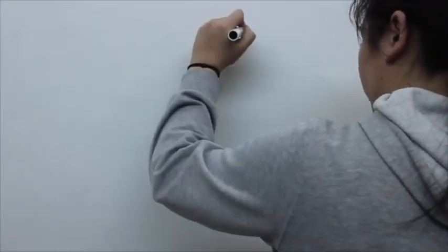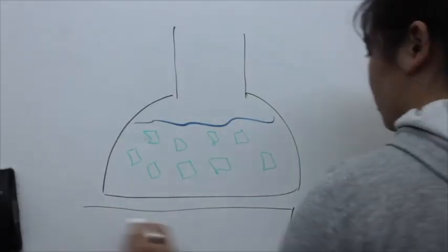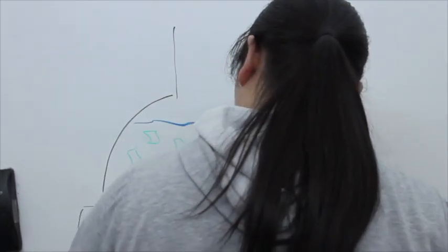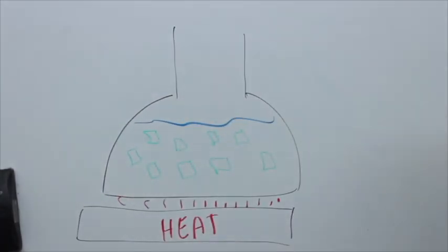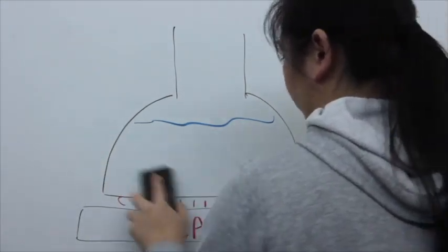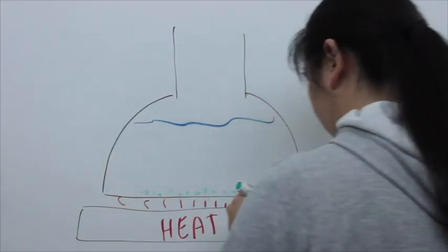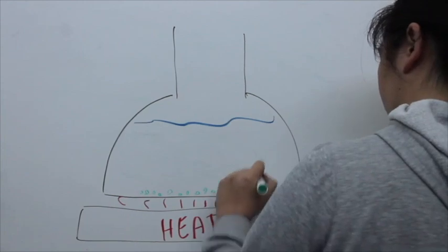Heating is required in order to properly dissolve and prevent crystals from forming before the impurities can be removed. As heat increases, the amount of solute allowed to dissolve in the solvent also increases. Depending on the solute, some impurities may have insoluble solids which cannot be dissolved. These are later removed in the next stage.